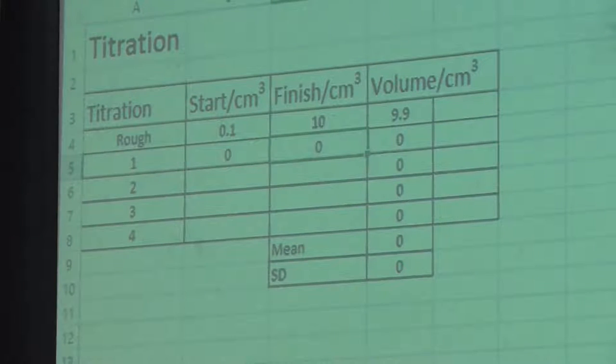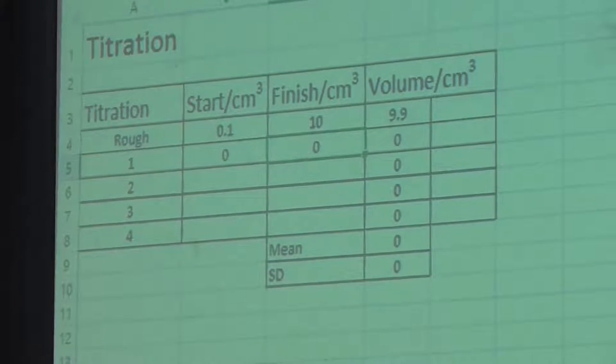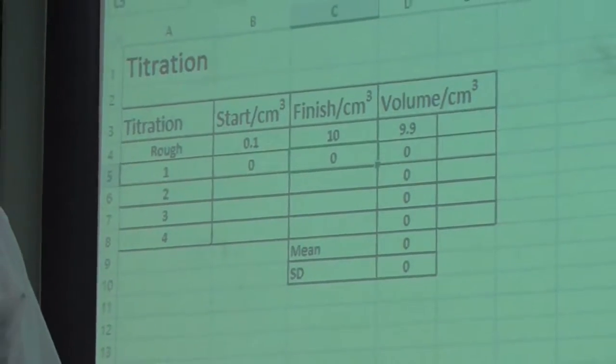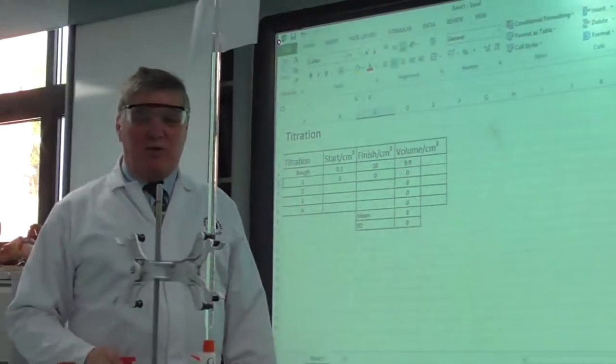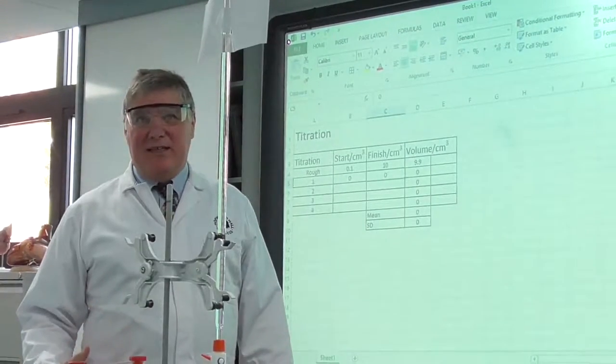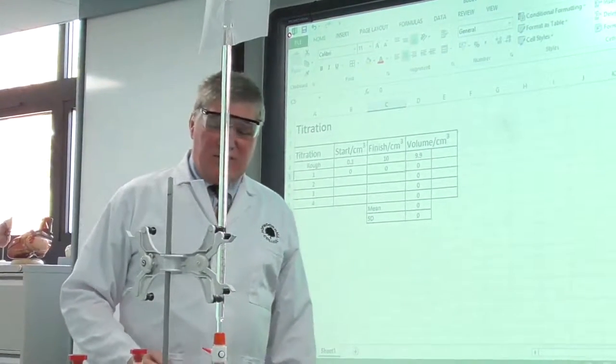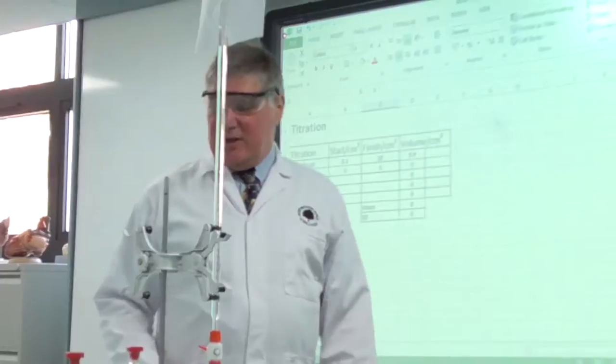Don't fall into the routine of topping it back up to zero. If you're in a professional lab, you don't want to be refilling your burette at each titration. So the next step is to run it. I know my starting point is now 10, our new starting point.